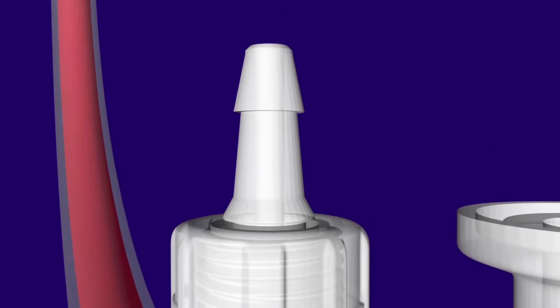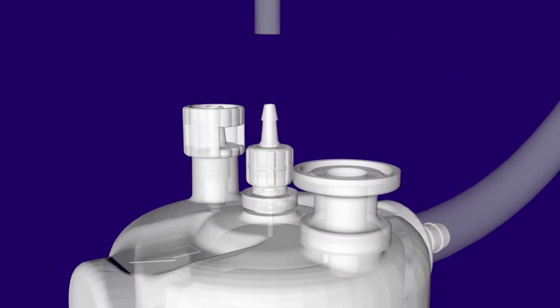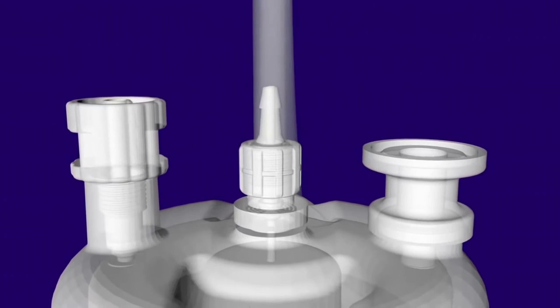the upstream inlet valve is closed. Then an inert gas source is connected to the ZenCap purge port. Inside the purge port, there is a gas sterilizing membrane.